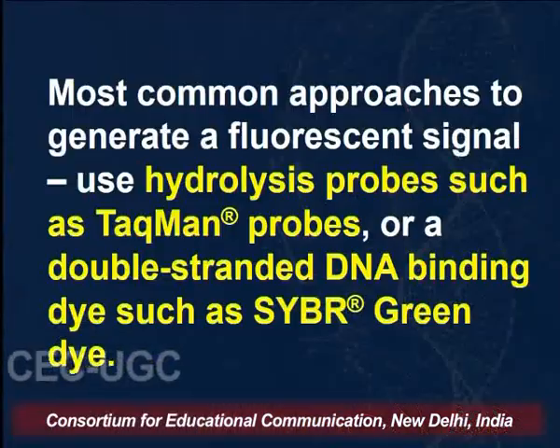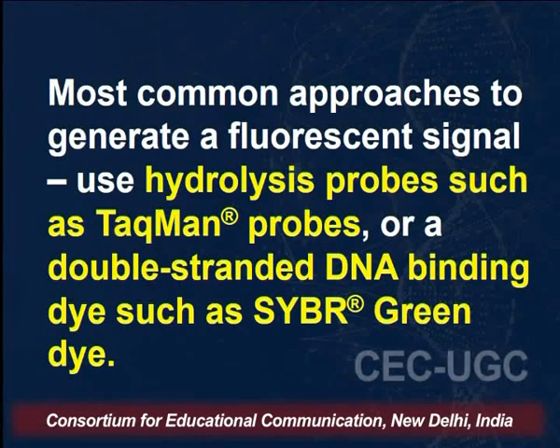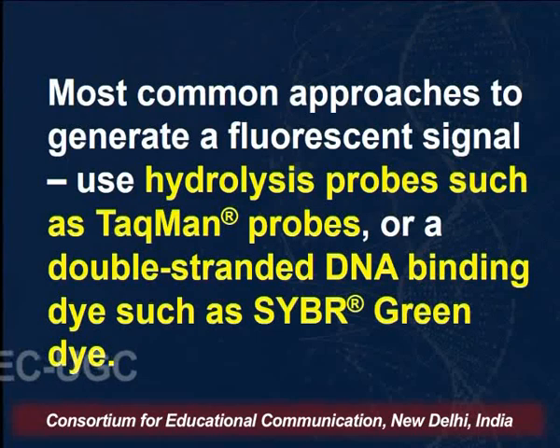Most common approaches to generate a fluorescent signal use hydrolysis probes such as the TaqMan probes or a double-stranded DNA binding dye such as SYBR Green dye.